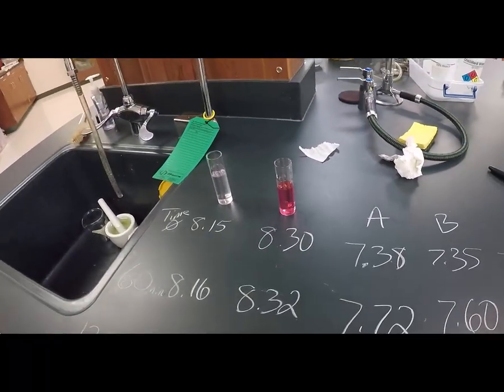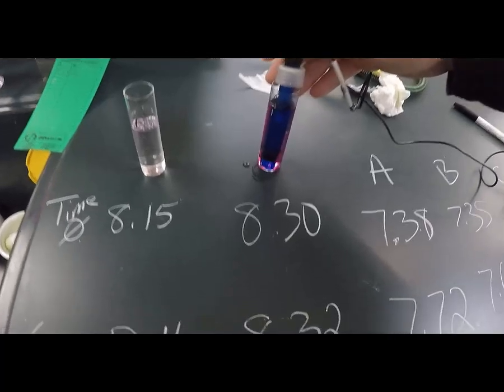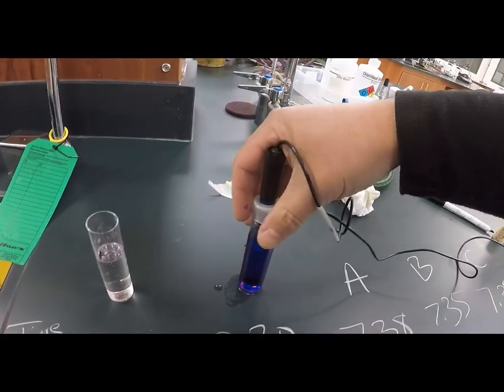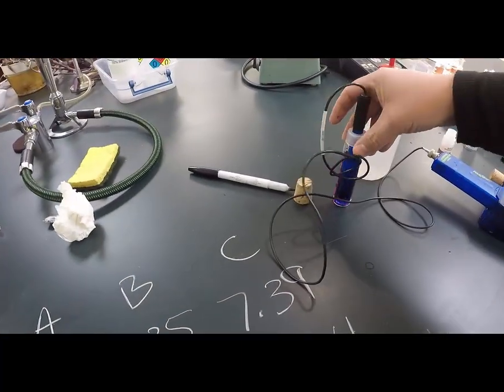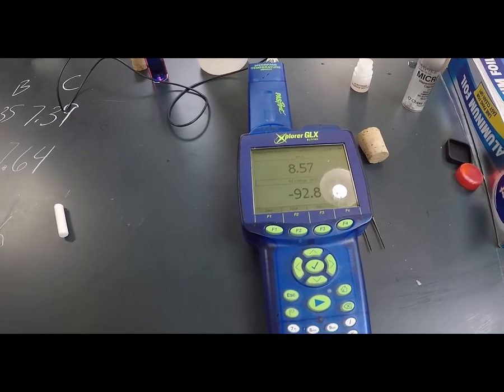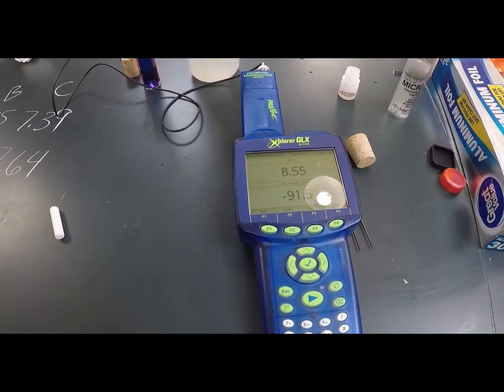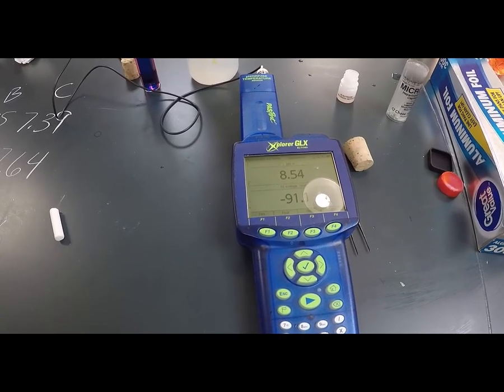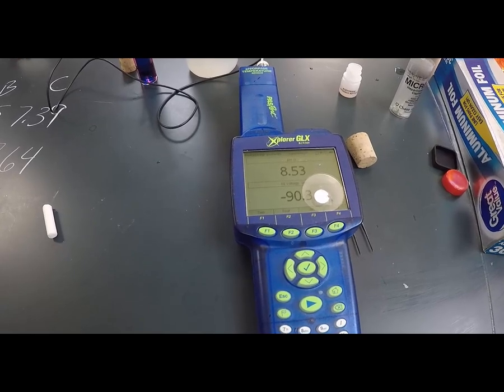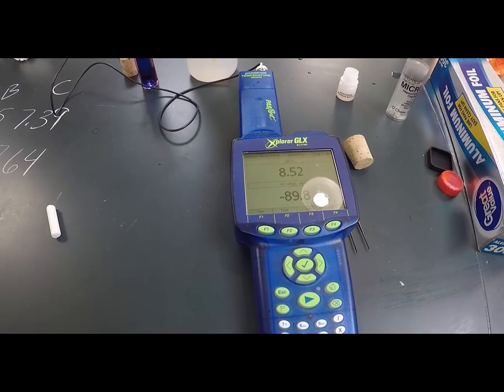If we switch it over real quick, see what the original sample was, maybe. Okay, so this is still in the 8.5.